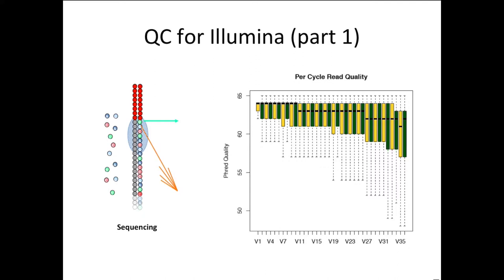Now, Matt tomorrow will show you how to plot some of these figures based on the FASTQ file. This is a very important quality control aspect. I didn't have time to add this to the slide, but just last week we did an experiment, and we plotted this after doing the experiment and realized that for the last two cycles, cycles 51 and 52, the average quality score was basically at the bottom of the figure. So what do you do when you have an extremity like this, which is very bad quality?